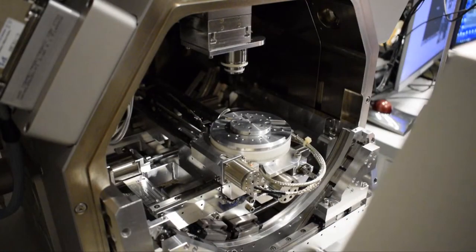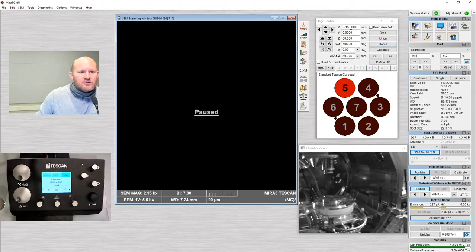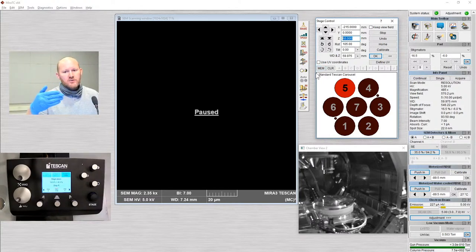I'm going to switch over to the chamber view. Venting is complete, and now what you see is the sample stage. If you look at the stage window, the last user should have left this at our loading position, which is X equals minus 215mm, Y equals 0mm, and Z equals 60mm. This is with the stage all the way down, closest to the door, and in the center position. Tilt should be 0. The WD/Z value right now does not matter, and I'll explain that in a minute.